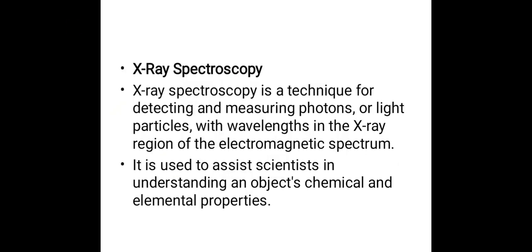X-ray spectroscopy. X-ray spectroscopy is a technique for detecting and measuring photons or light particles with wavelengths in the X-ray region of the electromagnetic spectrum. It is used to assist scientists in understanding an object's chemical and elemental properties.